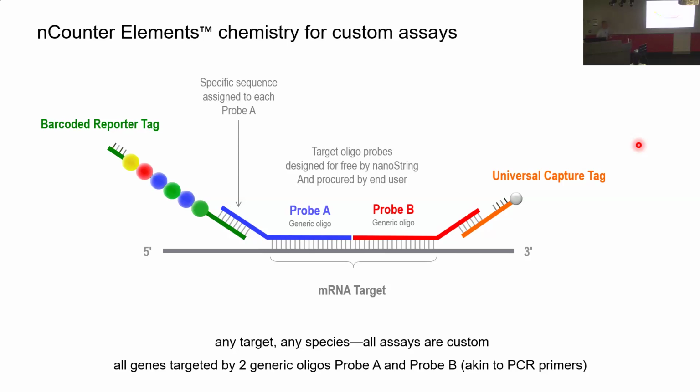So all this self-assembles. You set up a hybridization reaction, it all joins together. Now, the interesting thing is the probe As and probe Bs, no matter the chemistry, they sit right next to one another. There's no ligation to join them together or anything. But when they're like that, a few things happen. It's stable. Believe it or not, it's stable. So this tripartite complex, or in this case, it's five things together, it's stable. The RNA targets, of course, can be all different lengths. But the hybridization is done overnight. And in that process, they automatically nick down and basically disappear down to a tiny length. So they're all processed about the same length by the next morning. That's one of the tricks.